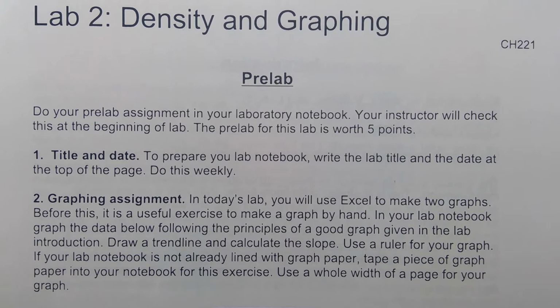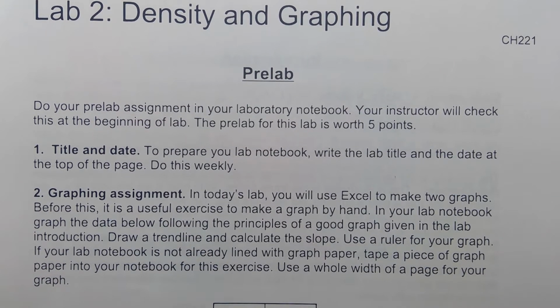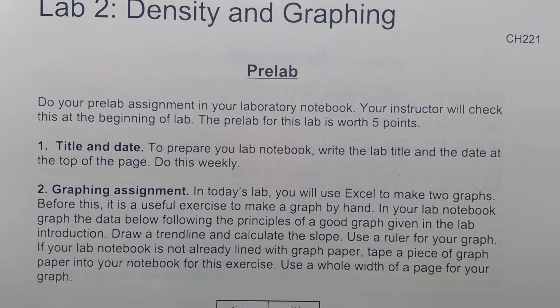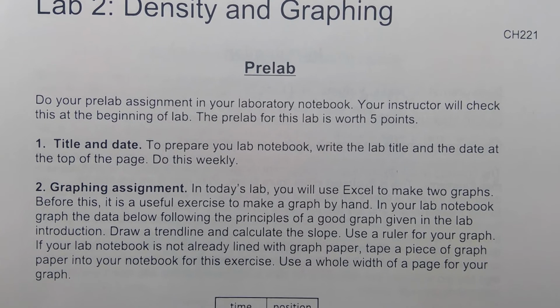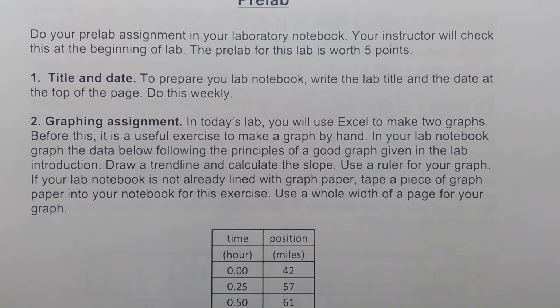So do your pre-lab assignment in your lab notebook. Your instructor will check this at the beginning of lab, so they might have you send your graphs or something before you do the lab. You'll want to have the title and date, and you should be doing this routinely with all of your pre-labs. And then a graphing assignment.